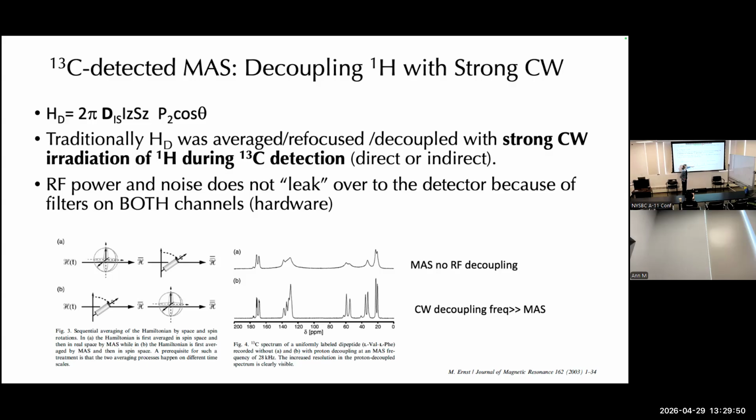You're going from unusable poor resolution, especially at the phenylalanine resonances of the carbon spectrum. And the alphas are very much affected by the rigid attached protons, particularly on the CH2 residues. And then all of a sudden they become usable with the CW.